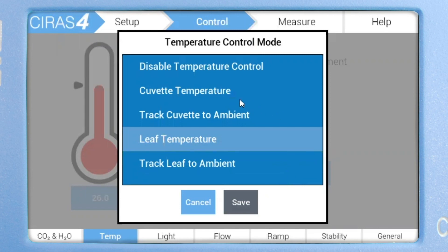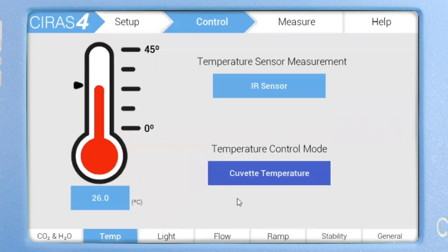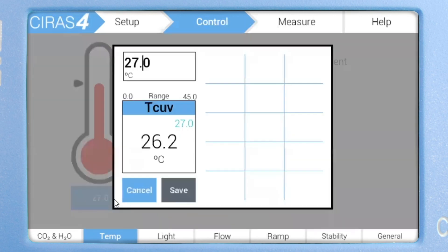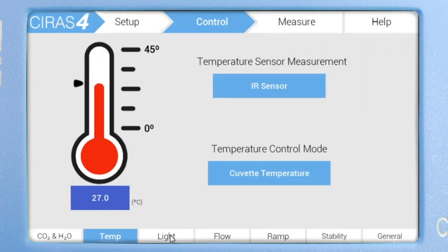Let's select cuvette temperature. Use the slider on the thermometer or manually enter a value, as with the other environmental controls. Let's set the cuvette temperature to 27 degrees Celsius.